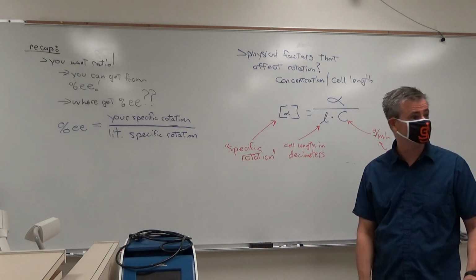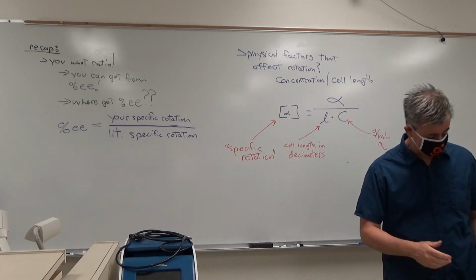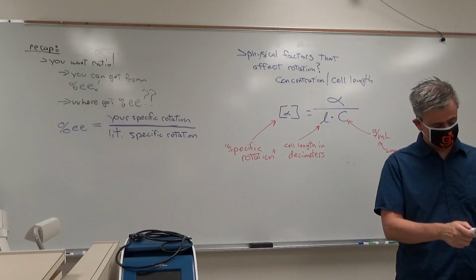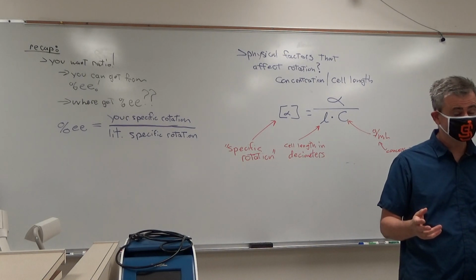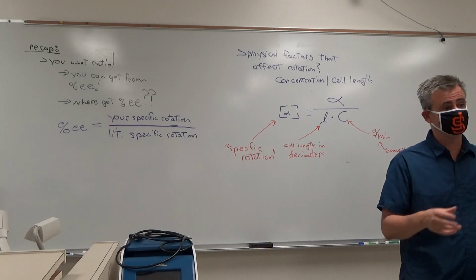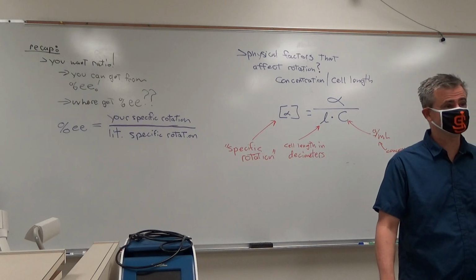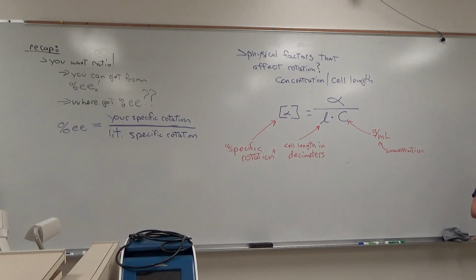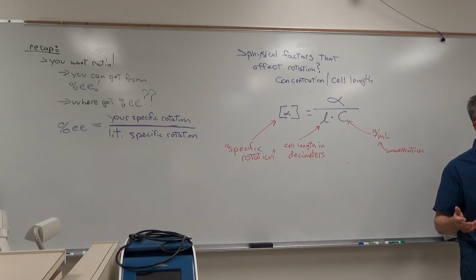But there's a wrinkle, a small little wrinkle. You're probably thinking there's enough here, we didn't really need a wrinkle. The wrinkle is that almost guaranteed your reactions didn't go to completion. So you have some ethyl acetoacetate in there. Maybe you do your subtraction and find that you have 200 milligrams of product.